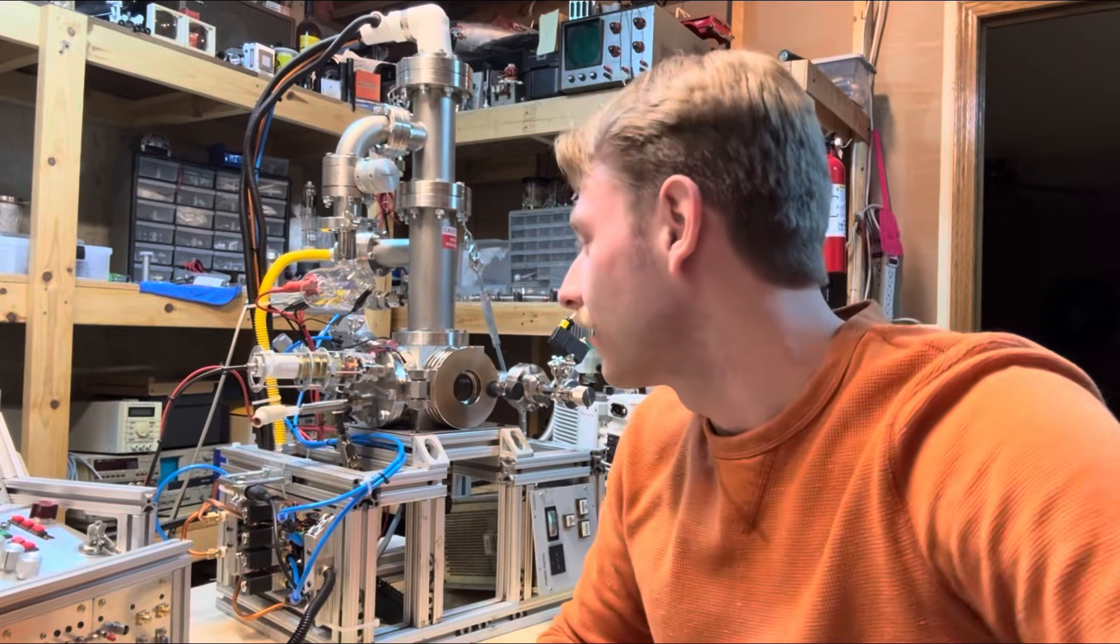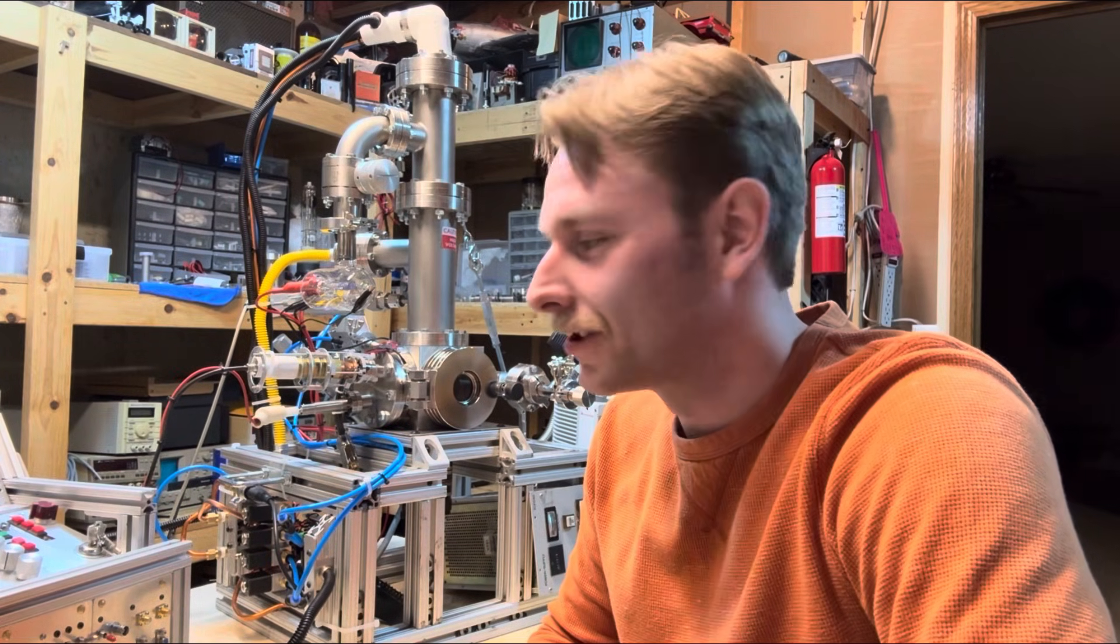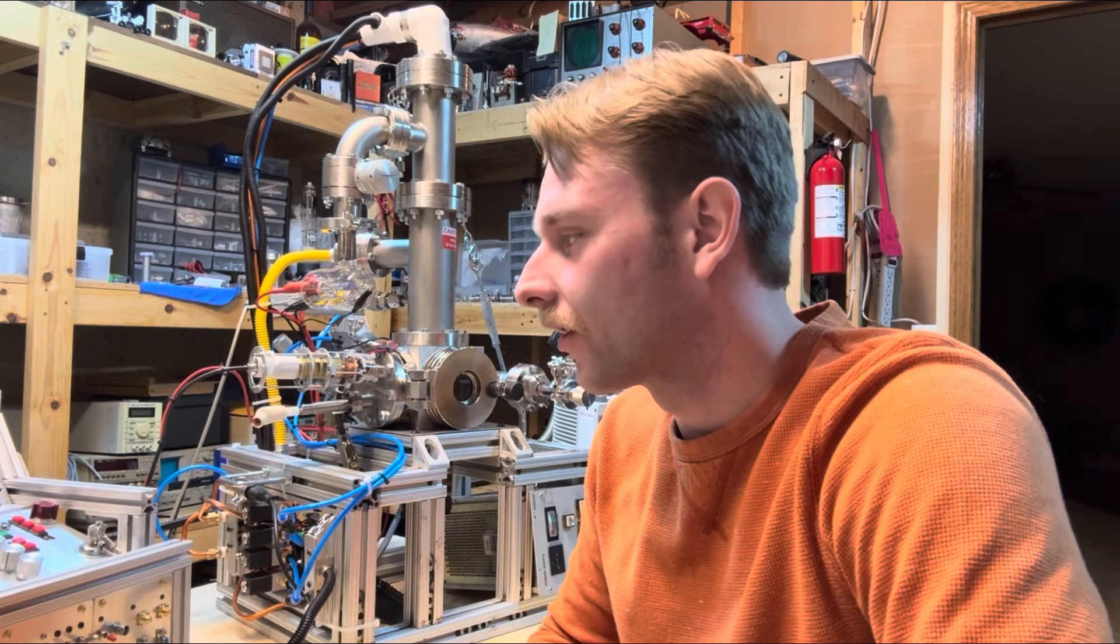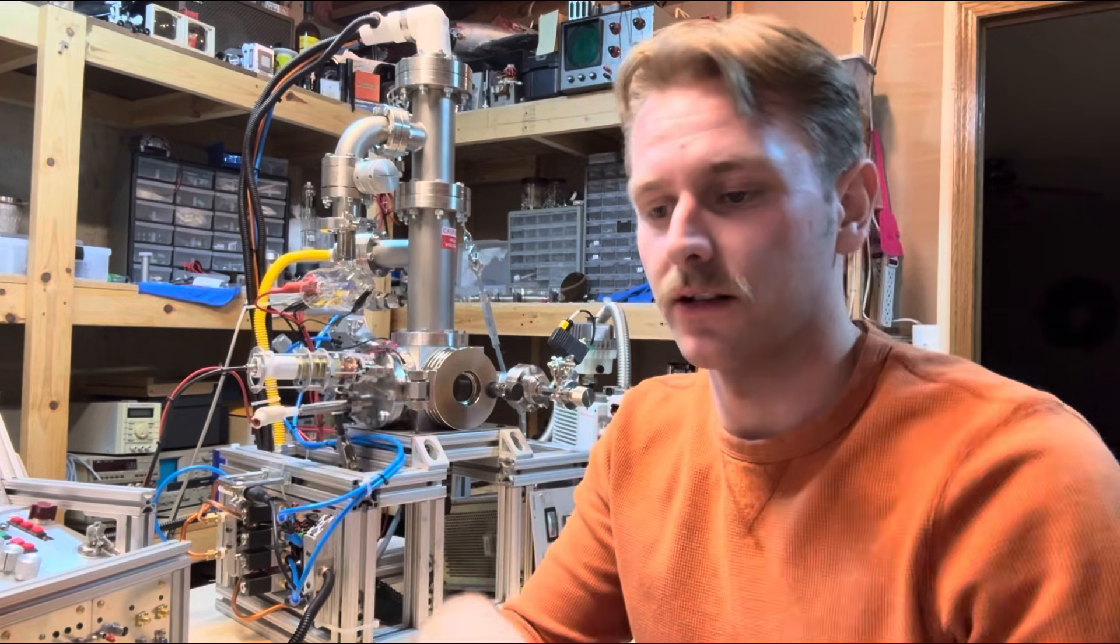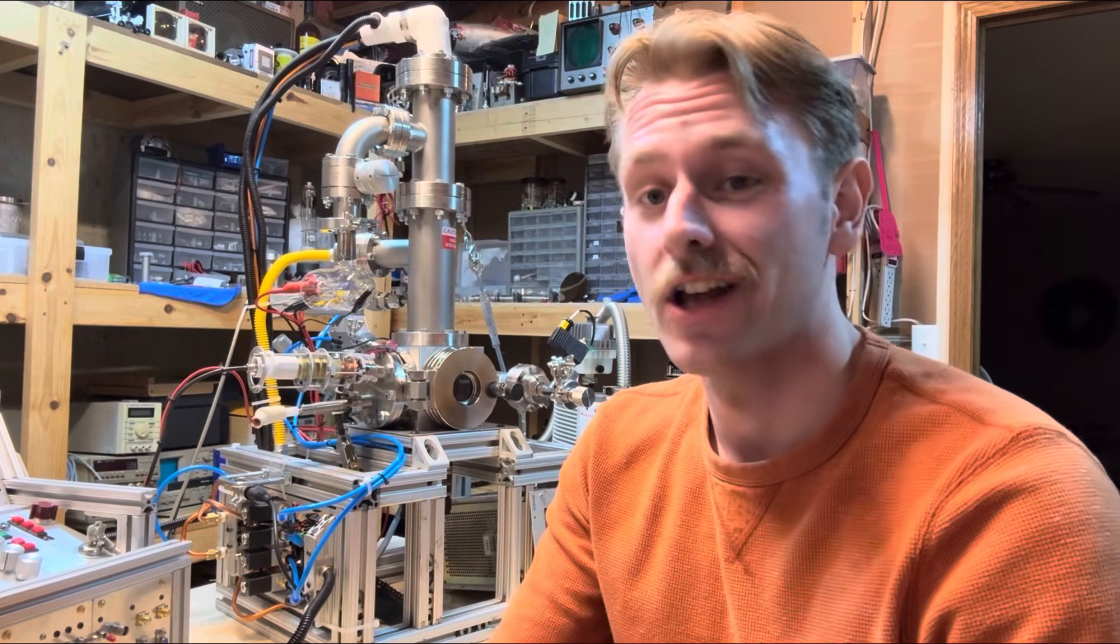It's like a tube that you would have in an old guitar amplifier. And that measures the current. Because there's going to be less things bumping into the electrons traveling across. And you're like, oh, I know that's 10 to the negative 9 torr. Because there's like this many electrons. That's what the electronics in there are doing.